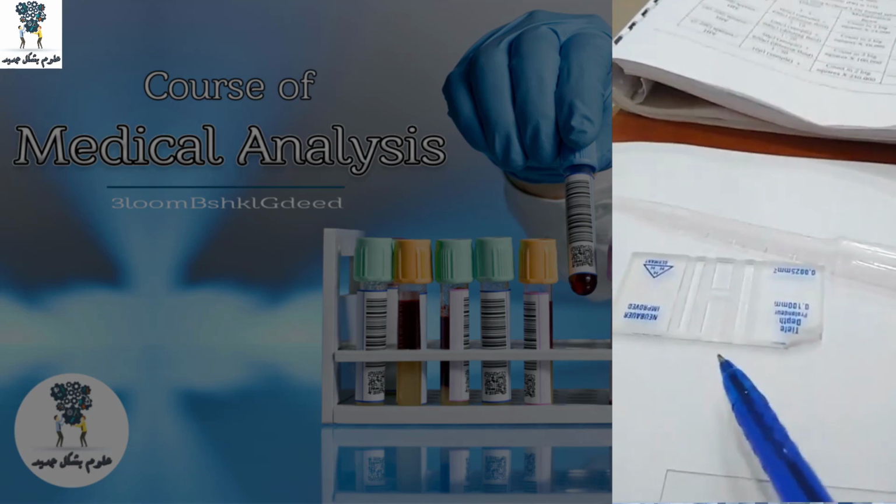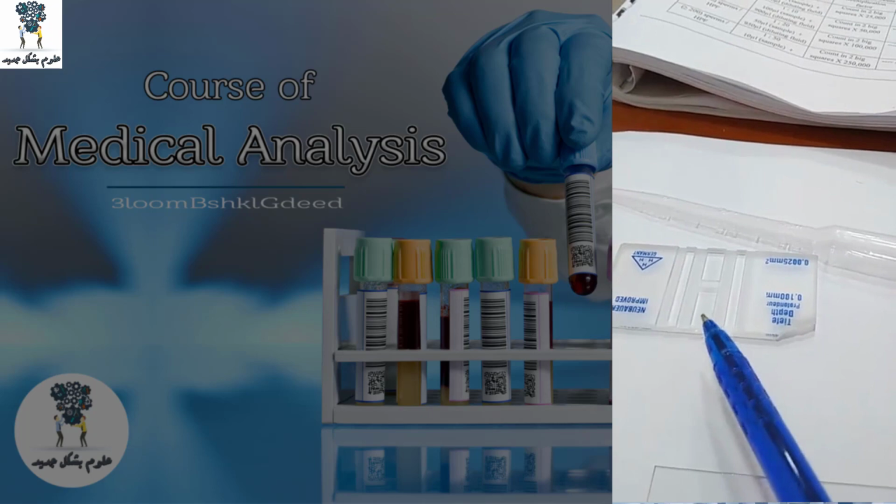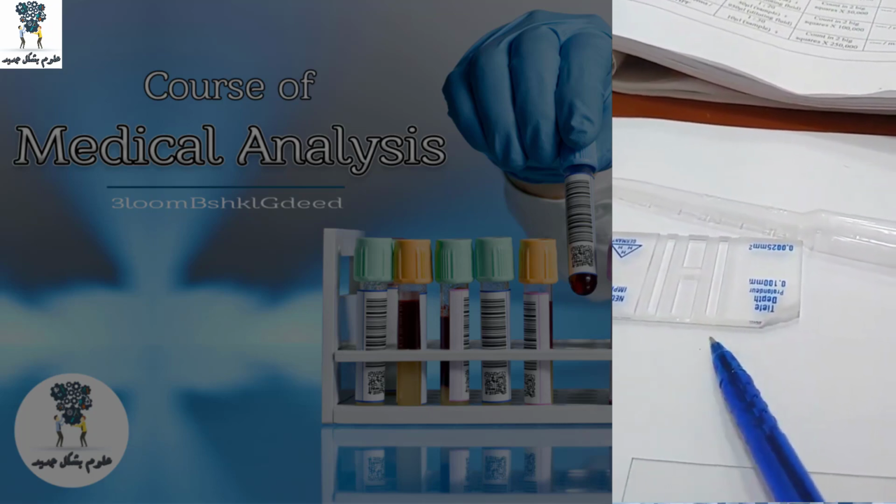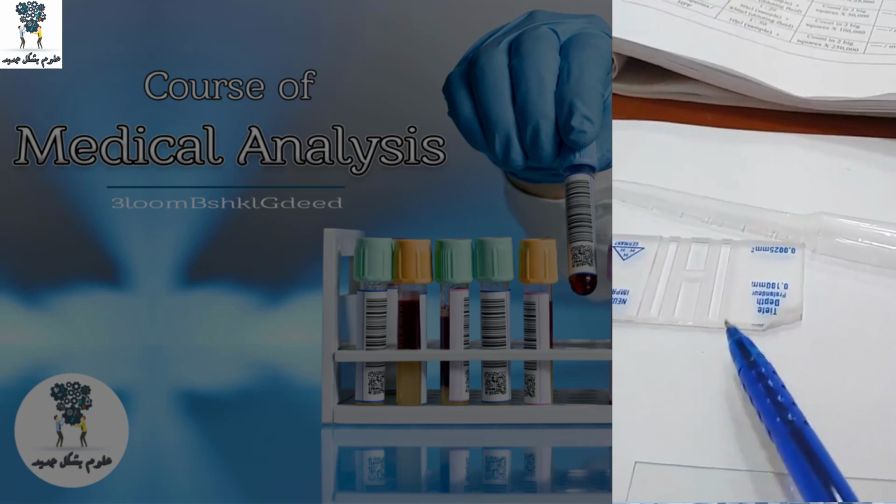We will take 10 microliters and put it directly on the counting chamber, without dilution.